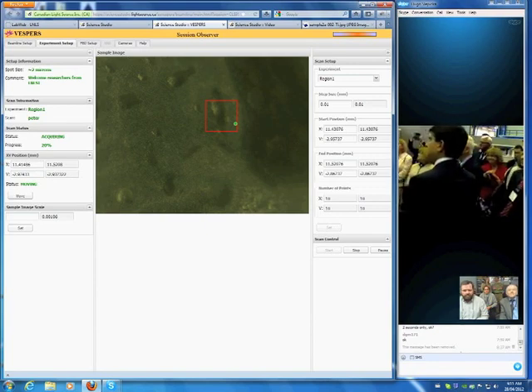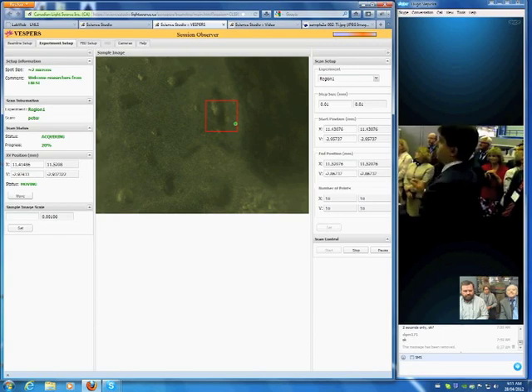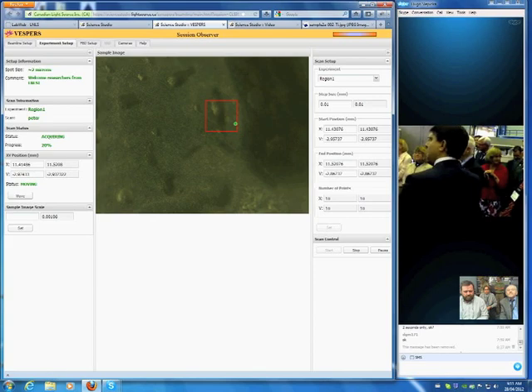Each dot is a point of the scan. Actually, it is the number of photons emitted by the atom. So what happens? You shine the sample, each atom absorbs the photons and re-emits with a lower energy, right?